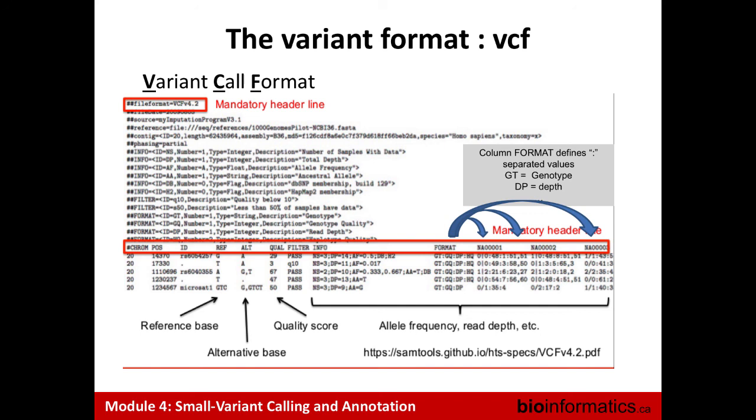Yes? This is in the multi-sample approach. So usually we send, I don't know, 10 or 20 samples at a time to get sequenced. And then those come back and they get run through GATK and all that. But are you saying that when it comes to writing a paper and we've got 150, 200 cases of the disease or phenomenon we're interested in, we would be better to pool all of them and run everything again? Or is it due to batch effects in the sequencing? Or is the assumption that the disease is homogeneous underlying it?